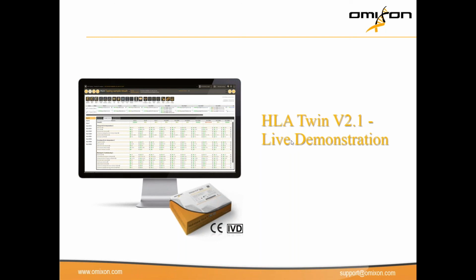Okay, and just one last question, because we are running out of time here. Can you handle single locus testing with the 11 locus HoloType testing? Sorry, could you just... Can you handle the single locus testing? Oh, yeah. For example, the monotype HLA with the 11 locus HoloType testing? Easily doable. We haven't set up our automation for that because we don't want to do that at the moment, but it would easily be done. So just to add to what Mette just said, yes, it's definitely doable, and a lot of different robots are able to handle that, exactly because they are able to cherry pick what needs to be done for each one of them. So it does improve the consistency and the accuracy of doing that process.